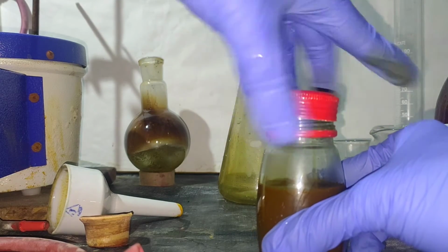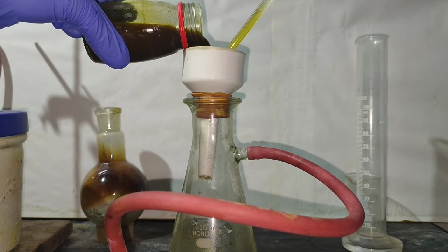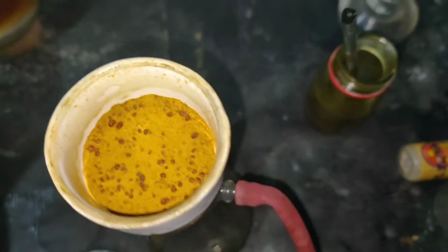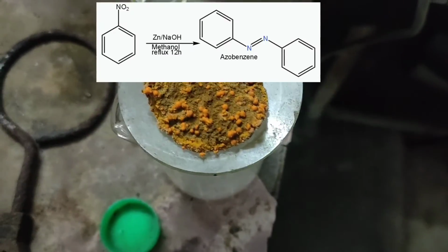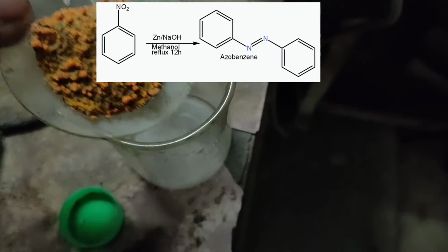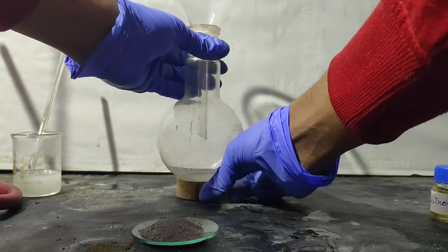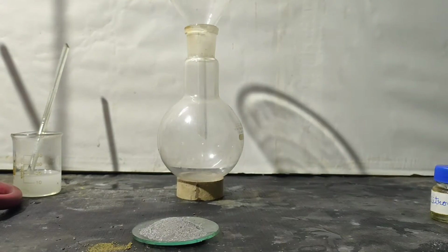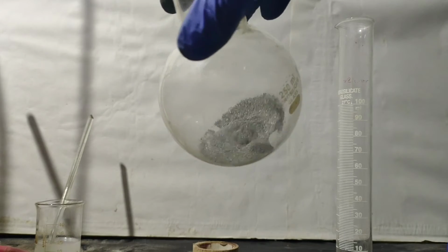A small amount of solid was formed which appears orange in color. It was vacuum filtered and the residue looks like this. This is probably not hydrazobenzene but azobenzene. Maybe my zinc powder was old. That's why I couldn't get a good yield of azobenzene or hydrazobenzene.